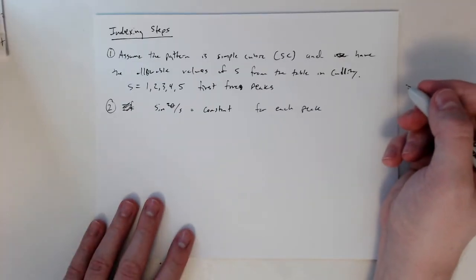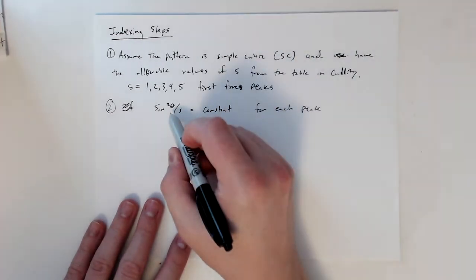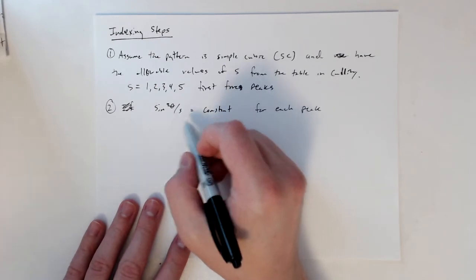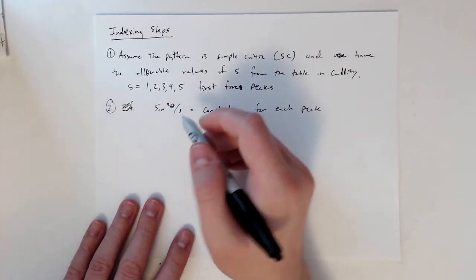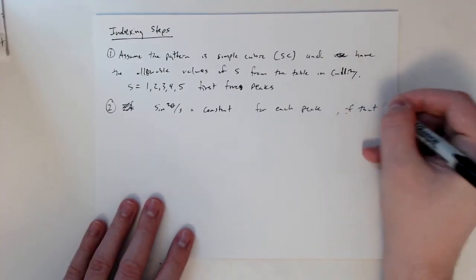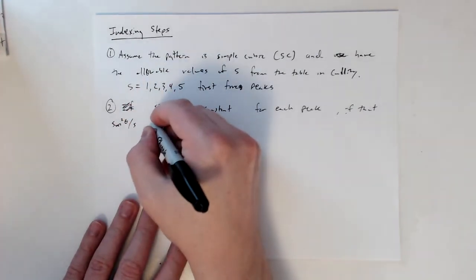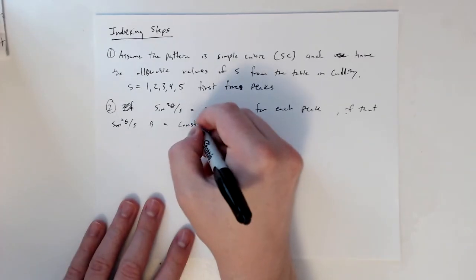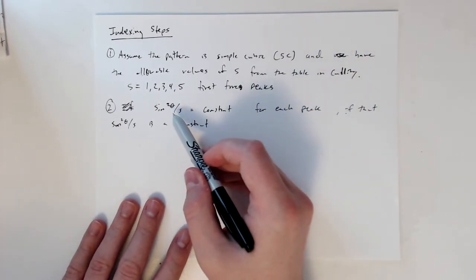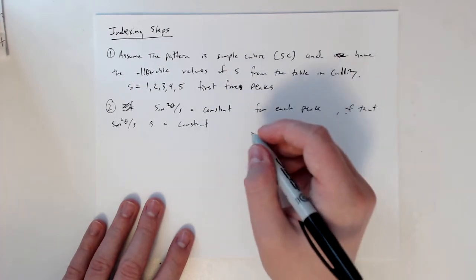So we have all the peak values, the peak centers for each peak, and that gives us a theta value. We have the S, assuming that it's simple cubic, and so we can calculate this value here. And if sine squared theta over S is a constant, so if all of the peaks give us the same sine squared theta over S value, then that tells us that our assumption is correct.